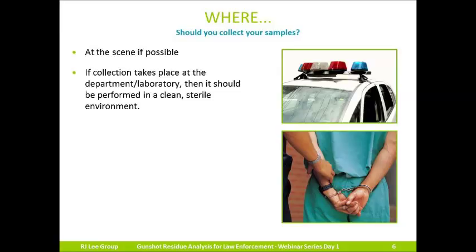If you should collect the samples as soon as possible, that typically means that you will be collecting samples at the scene. By collecting samples at the scene, there are fewer opportunities for contamination to be introduced and fewer chances for movement or activity of a subject over a period of time. However, we do realize that it's not always possible to collect samples at the scene.